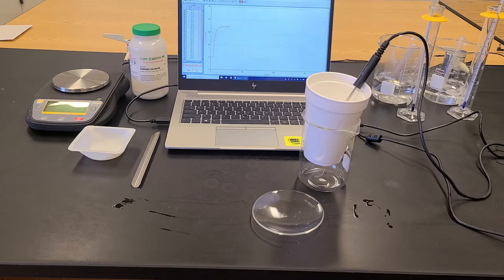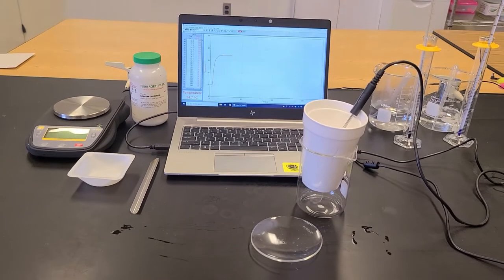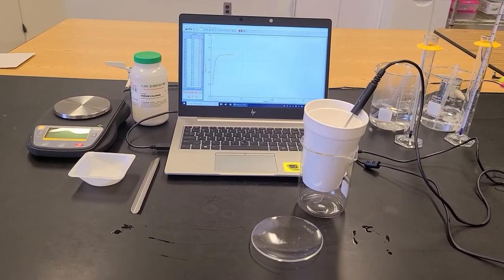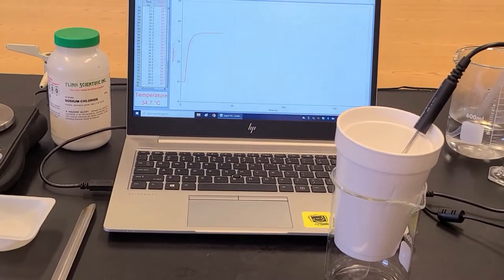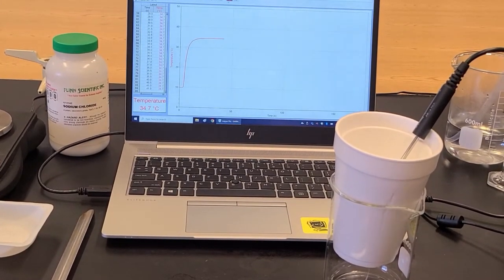So we can see on the graph there that it's starting to get that sort of flat plateau which is indicating to me that the temperature is remaining constant. So I have my final temperature of the water of them mixed together.